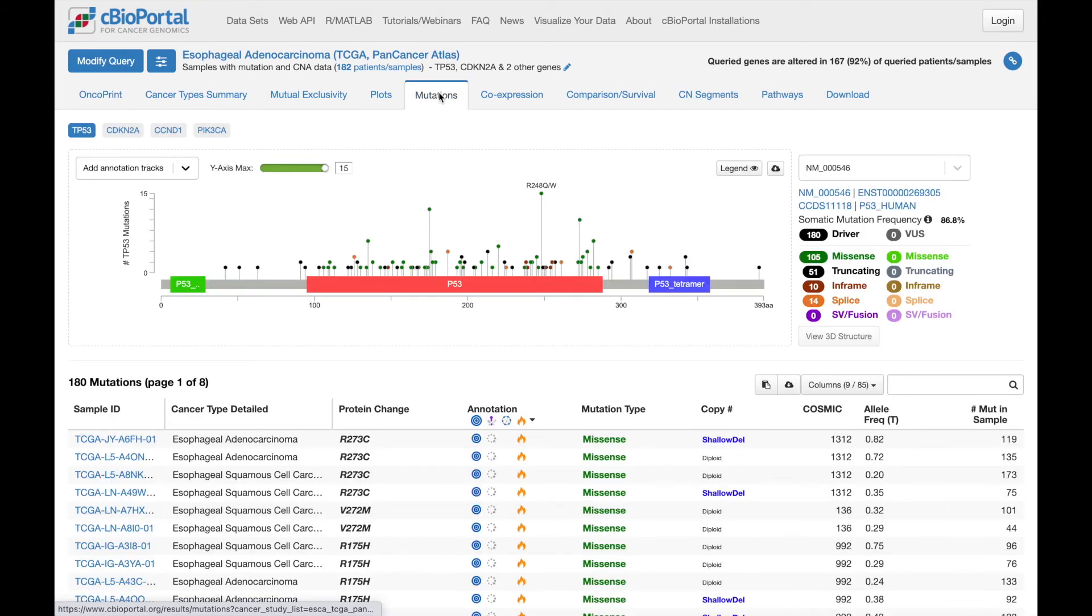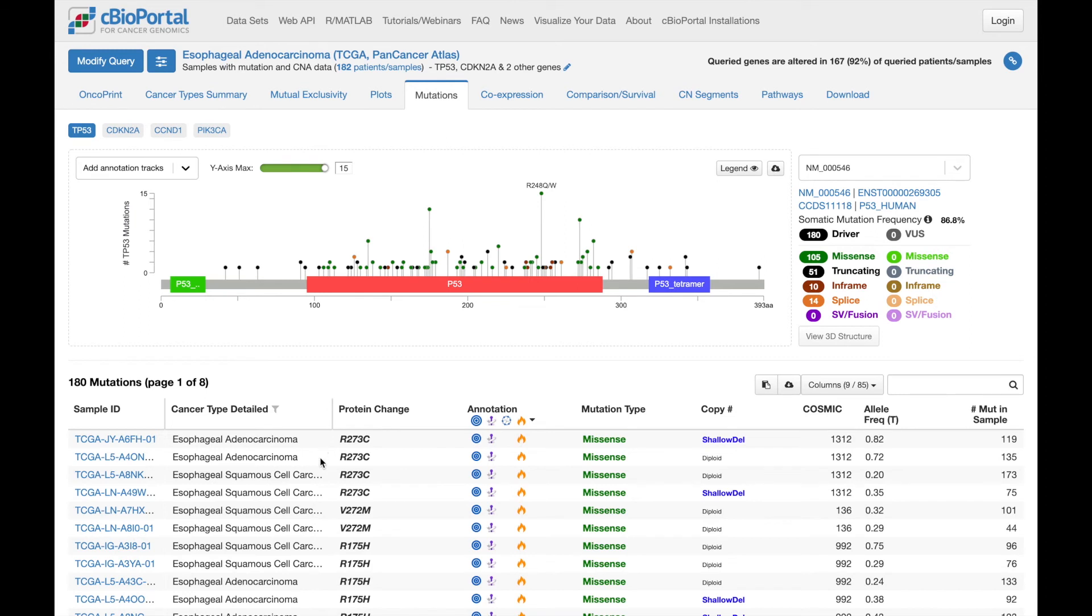Here, you'll see the distribution of mutations across a gene, here in this plot at the top of the page. And you can explore each mutation in detail in the table below. Each row here is a mutation in a particular sample.